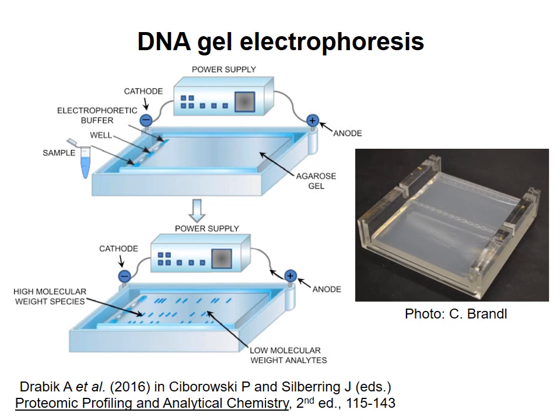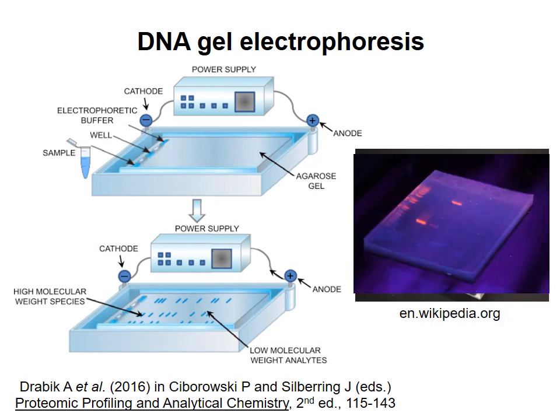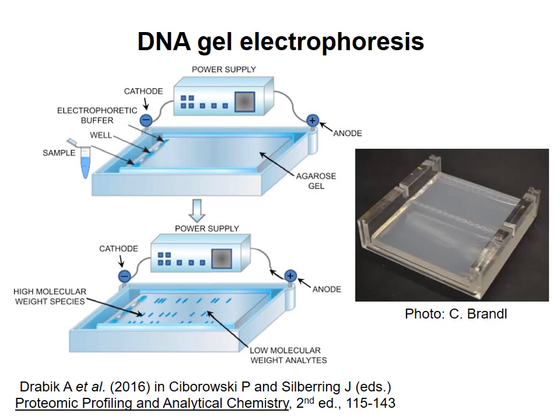Note that you can't see RNA or DNA molecules with the naked eye on a gel. If you want to see them, you have to add a dye such as ethidium bromide, which will bind to the nucleic acids. When you shine ultraviolet light on the dye bound to DNA or RNA, it glows, allowing you to see the nucleic acids, as shown in this photo. But for northern blotting, you don't add any dye.